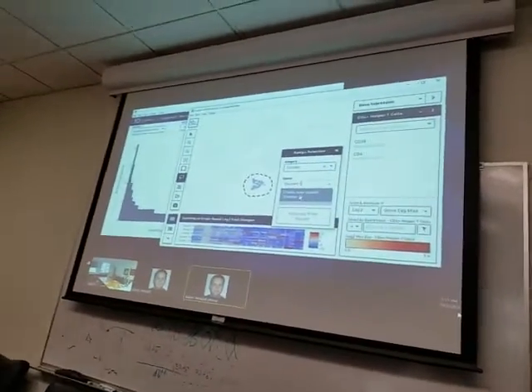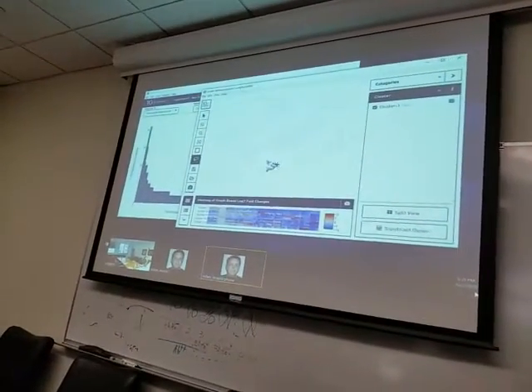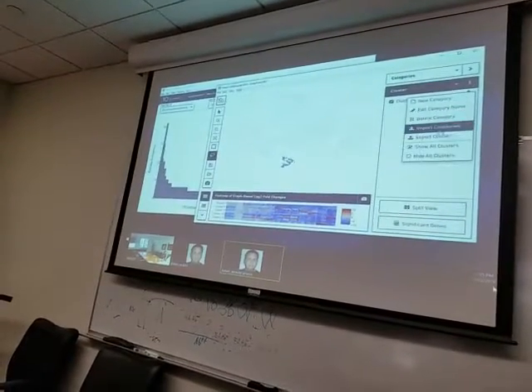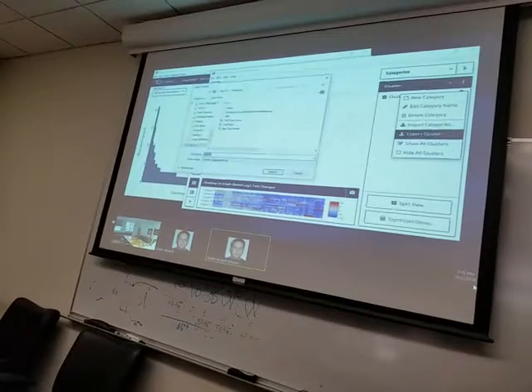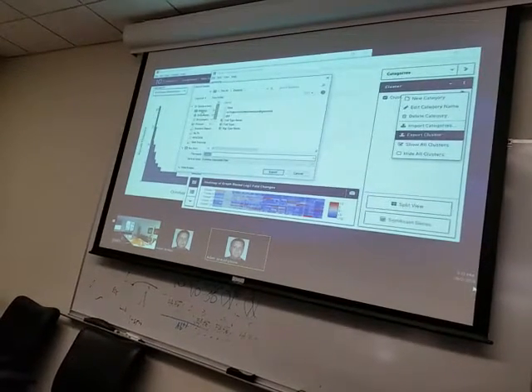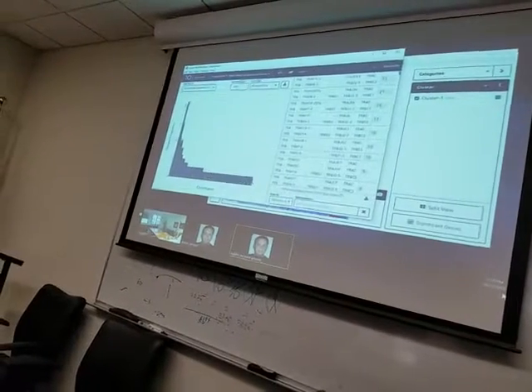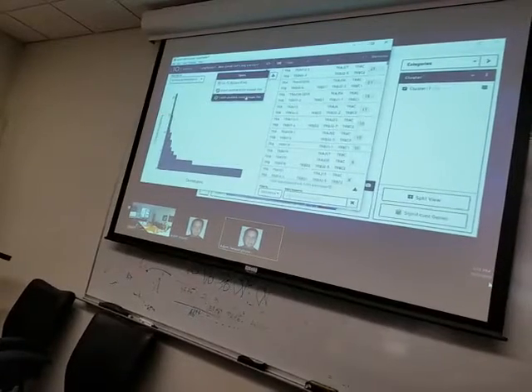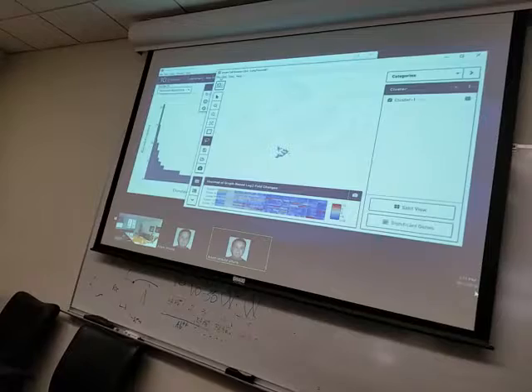Let's give it a name. So I can save this. We already talked about how we can categorize stuff and export those names, excluding unlabeled. But now I can go into the BDJ data, and I think I have to save this.